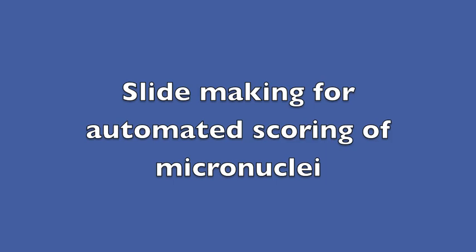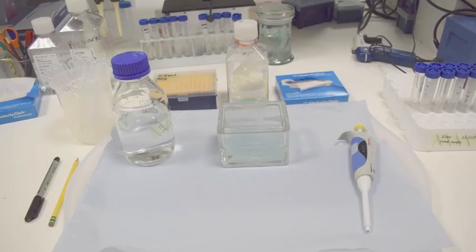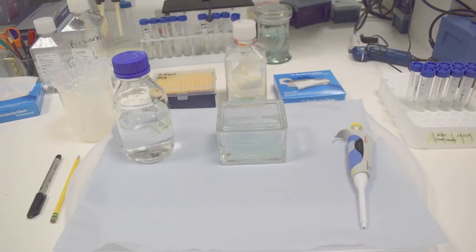Slide making for automated scoring of micronuclei. Slides are prepared by pipetting 100 microliters of cell suspension in fixative directly onto slides.